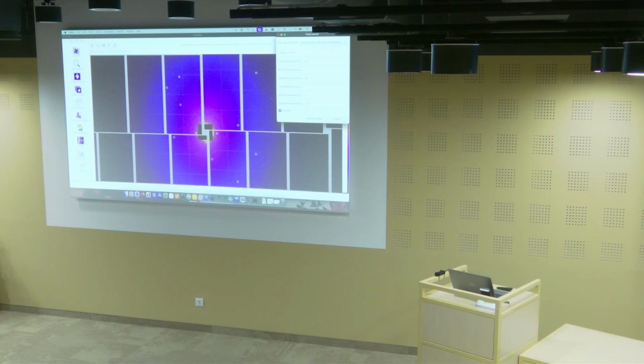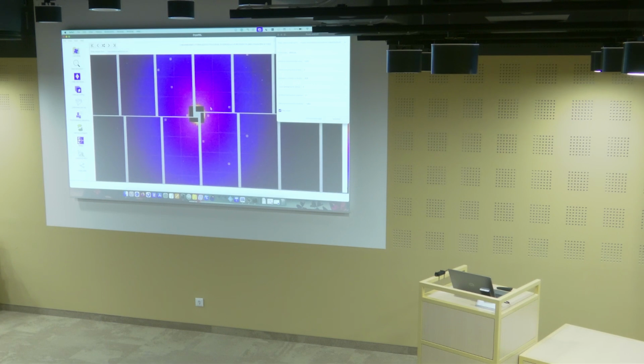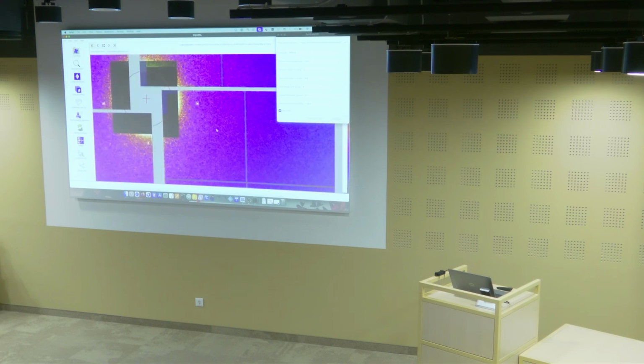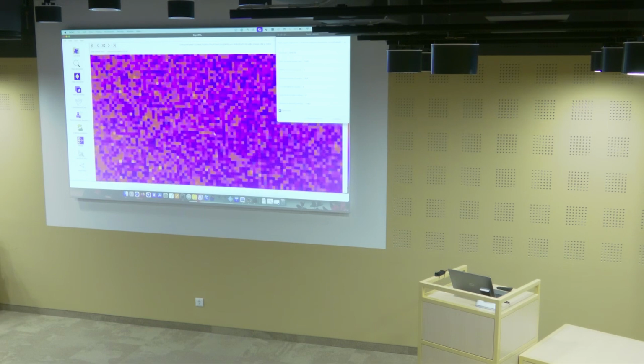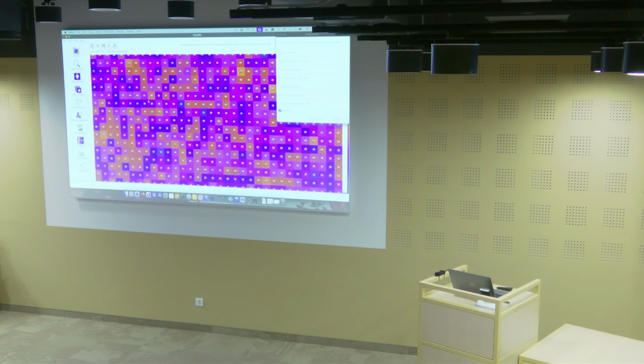So it has a value for the threshold, so it means like, okay, what's the minimum value that we need to have a peak? And another parameter to play also with is the signal to noise ratio. So to find the threshold, what we're going to do is we're going to zoom in quite a lot until we see the values. And I'm not zooming in on a peak here, I'm zooming in on the background, because I actually want to know what the background value is so that I can just take a value which is a bit higher and I know that that will be a peak.